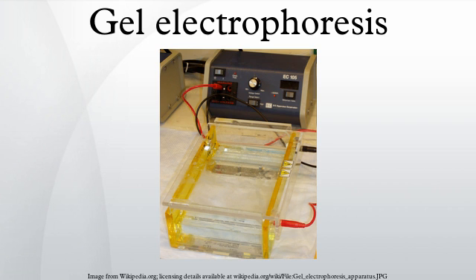Native gels are run in non-denaturing conditions, so that the analyte's natural structure is maintained. This allows the physical size of the folded or assembled complex to affect the mobility, allowing for analysis of all four levels of the biomolecular structure. For biological samples, detergents are used only to the extent that they are necessary to lyse lipid membranes in the cell. Complexes remain for the most part associated and folded as they would be in the cell.